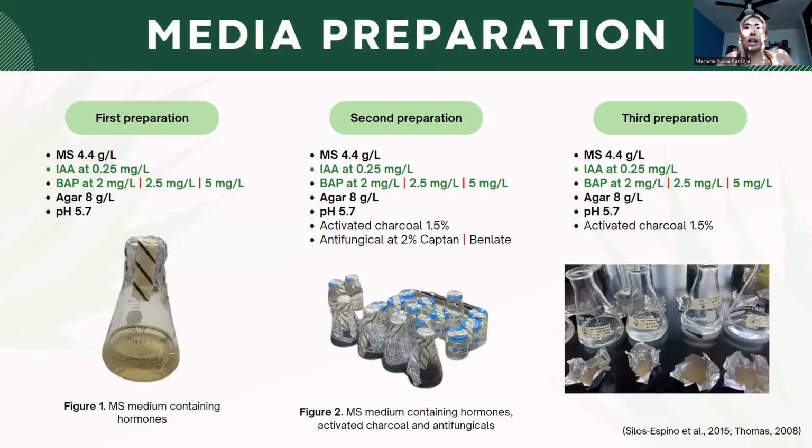For our methodology, we had different media preparations, and we had several methodologies. For the first preparation, we only used MS as well as the hormones and agar, and its pH was adjusted to 5.7. For the second preparation, we decided to add activated charcoal to combat oxidation and two different antifungicals, Captan and Benlate. However, this turned out to be a mistake because by adding the antifungicals, the media was not able to solidify. So for the third preparation, we decided to remove the antifungicals.